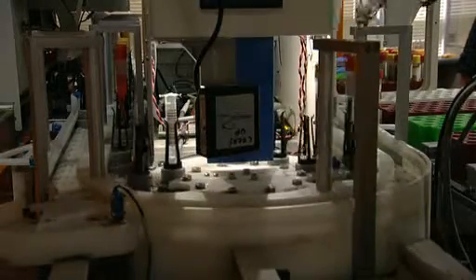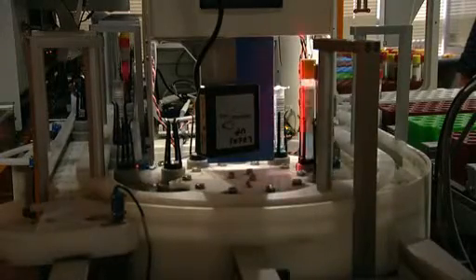The market segments that we're involved with, the traditional market segments, was all of the analytical environmental testing laboratories. But in the mid-90s we moved also to go into the clinical diagnostics and pathology markets. So we changed our strategy, or we incremented our strategy, up to developing a product to handle blood tubes.